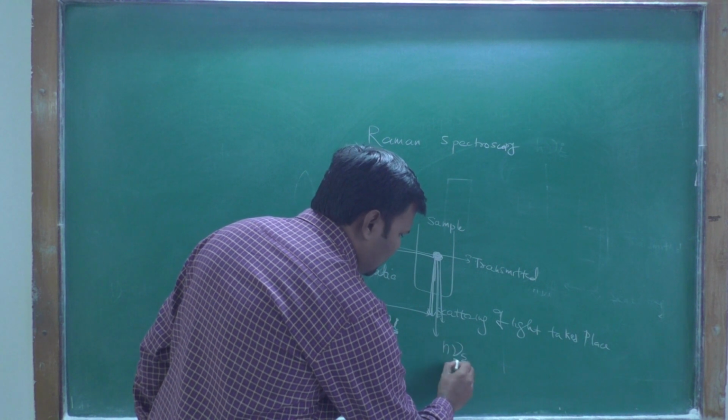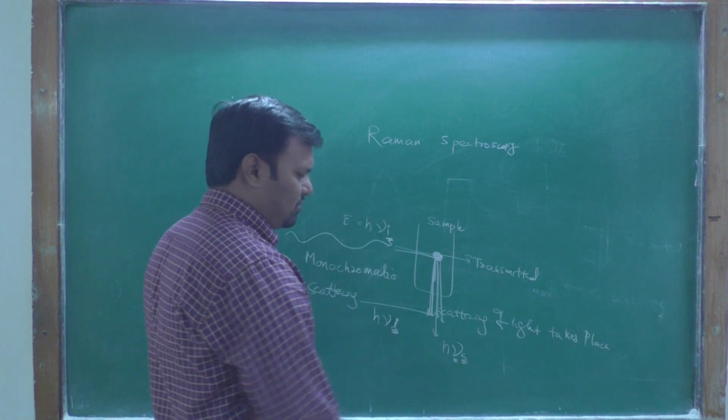The frequency of the scattered light is changed.